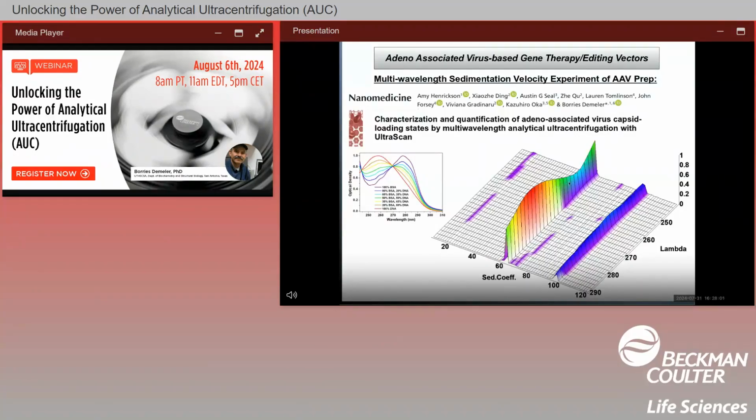It has the typical signature of a protein with a peak at 280, a valley at about 255, and then the amide backbone absorbing again at wavelengths lower than 250 nanometers. And that would match something that has this purple trace here, like BSA.